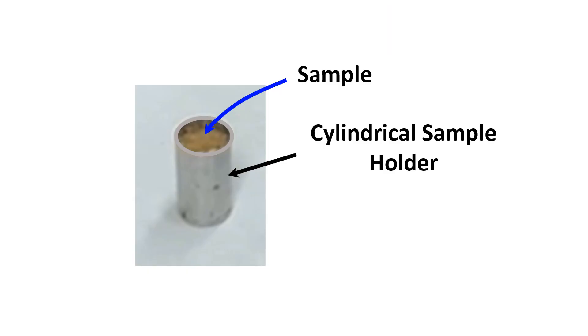We need to fill a cylindrical sample holder with a sample. In this experiment, we used freeze-dried sardine. However, any other forms of sample could be used, such as powder, liquid, or gel.